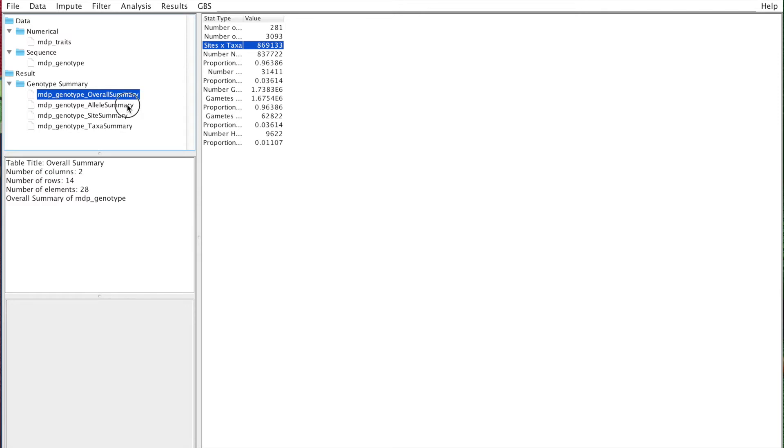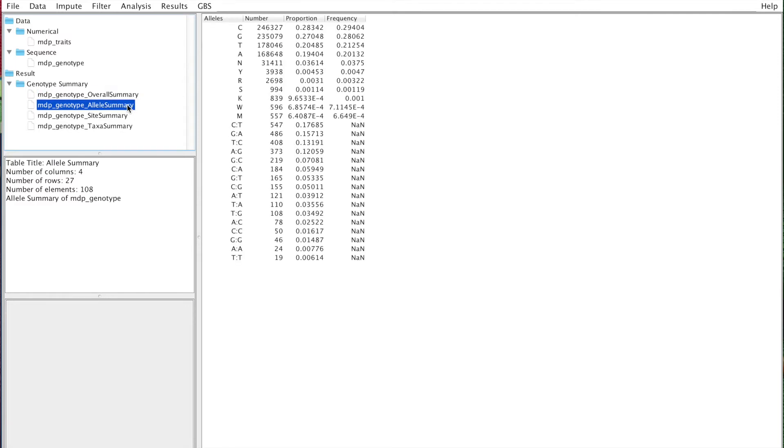The allele summary is also a rough view of the data. You have the frequency of the different alleles, and one of the things you can look at is if the proportion of CGTA is reasonably equivalent.